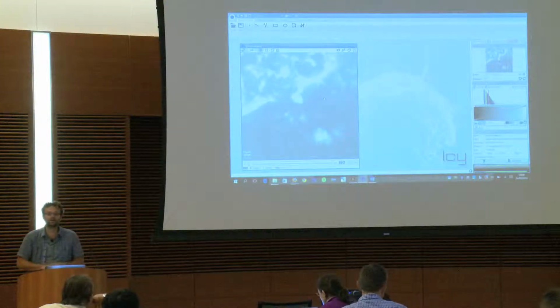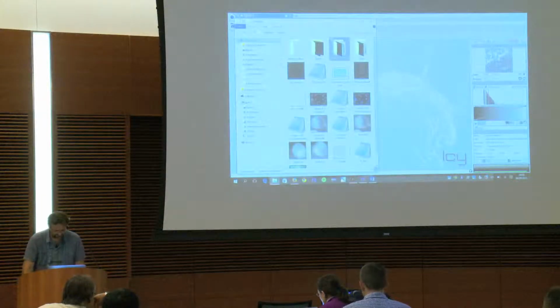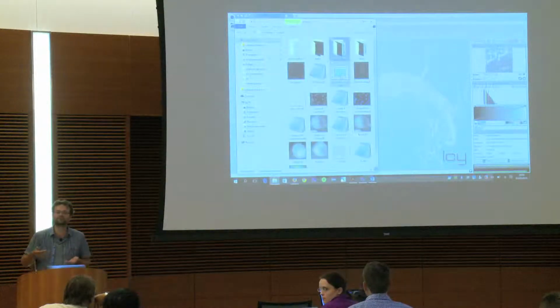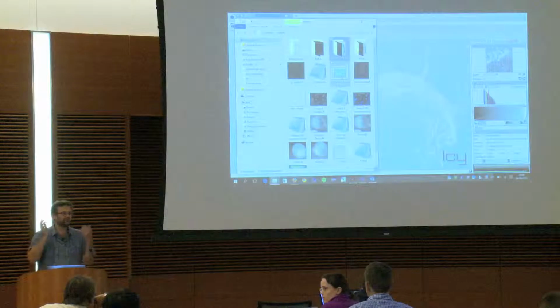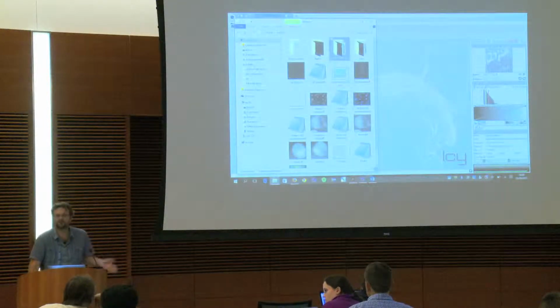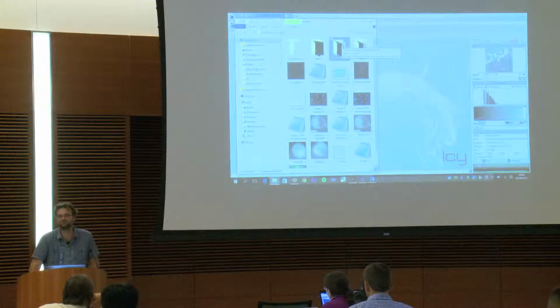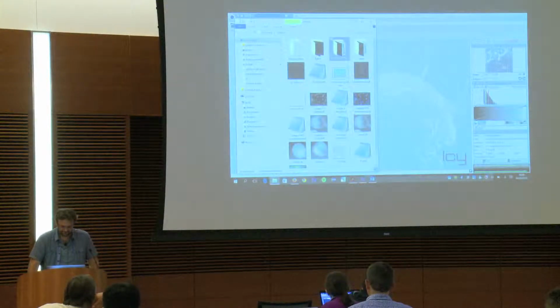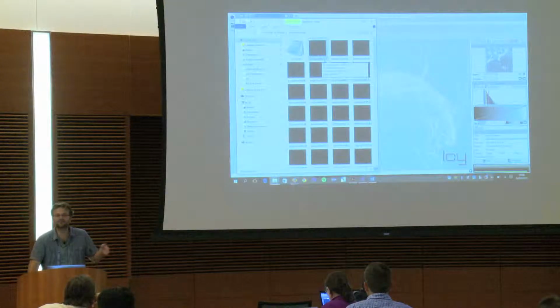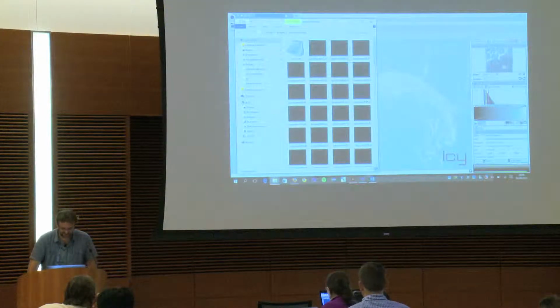How do I open it? I just took the particle tracking folder. Within it you have a lot of images, but we are using Bio-Formats as an input, and it's done an excellent job, so we do not even deal with this. Here it's projection 001, but if you have fancy things like T001 or Z001 or C something, we parse it to put it in the correct dimension.